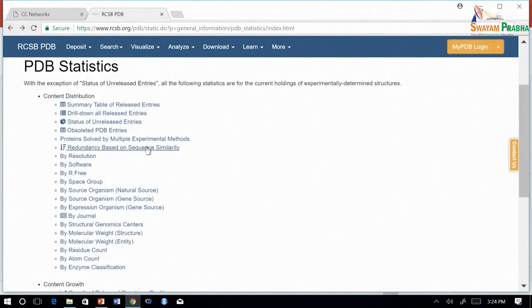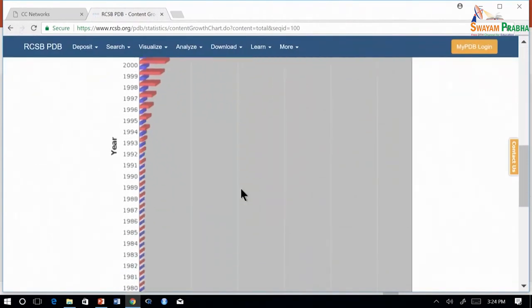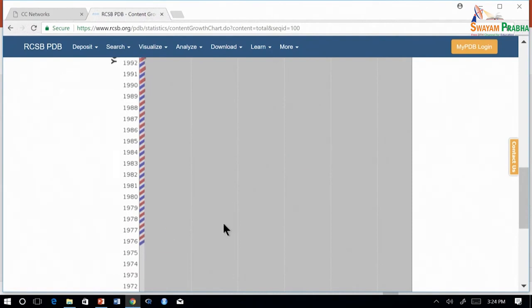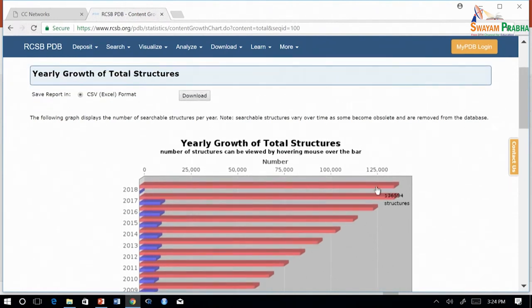To explore further, you can see the data by molecular weight, by residue count, or by resolution. All these data is available for exploration and further study. PDB also gives statistics by content growth. This shows how the database has grown over time. Statistics have been kept every year since 1976. Let us see the statistics here. The records start from 1976. As you can see, the amount of data being deposited in PDB has grown over the years.